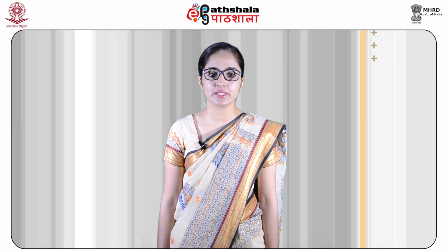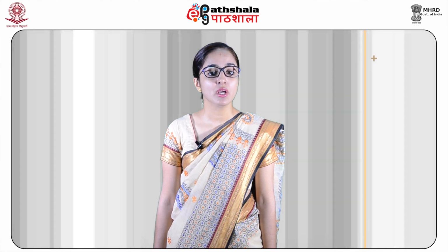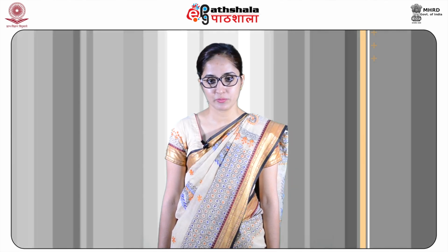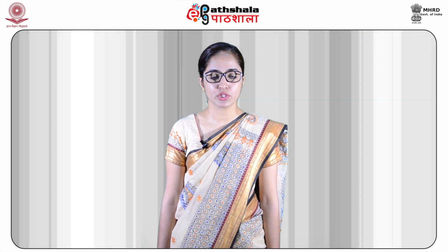Many 2D NMR techniques are there like HETCOR, COSY, eCOSY, NOESY, HMBC, HMQC, ROESY, HSQC, INADEQUATE, TOCSY, etc. These techniques are very useful for detection of various structural aspects of an unknown compound. COSY and HETCOR have been described in this module in detail. I hope students, you have found this module very informative.